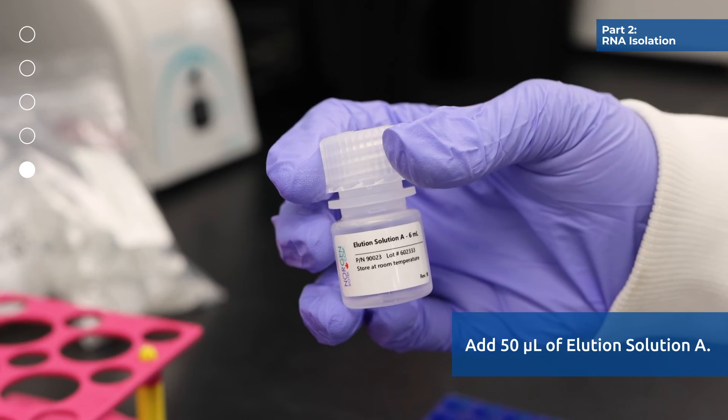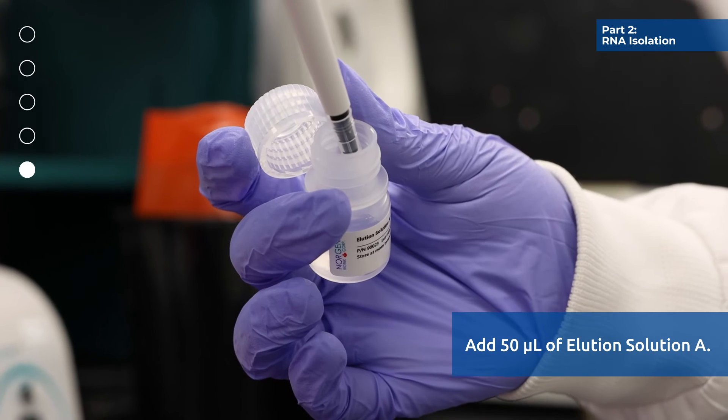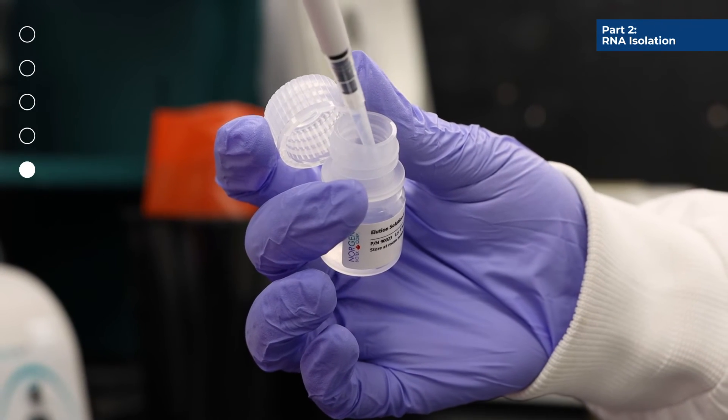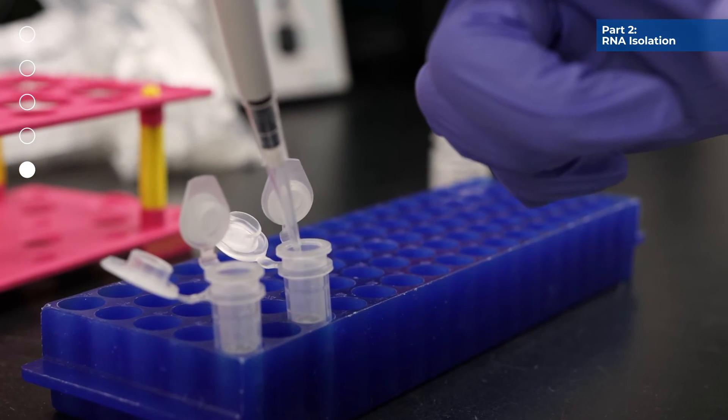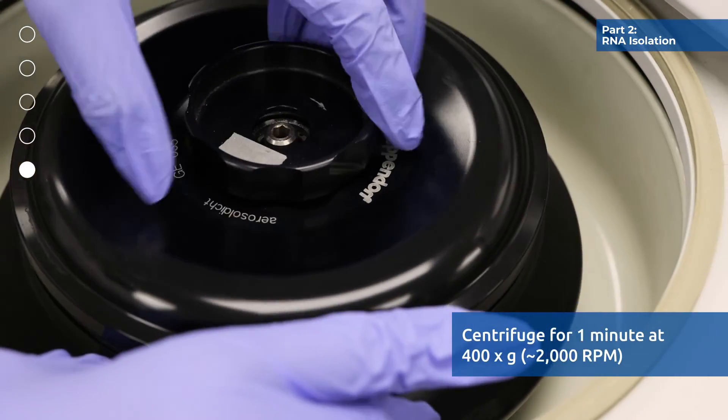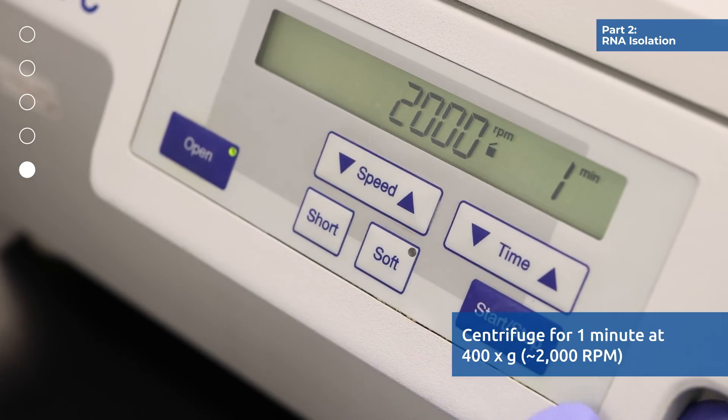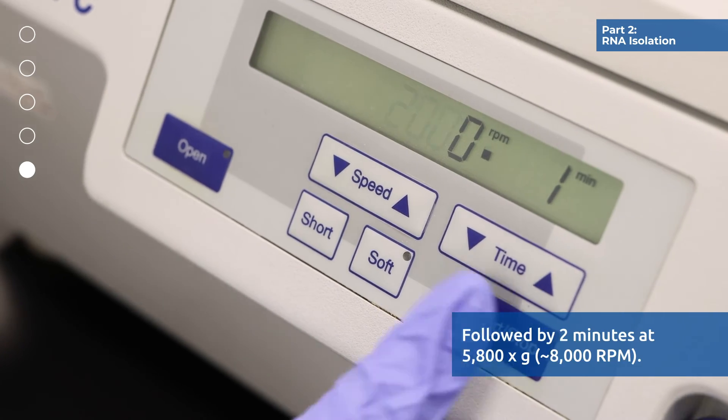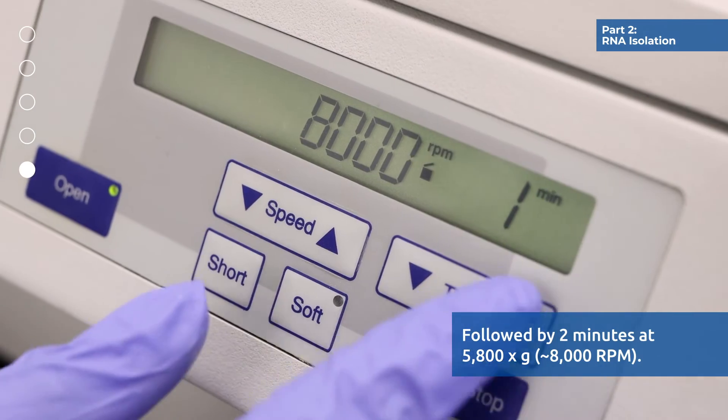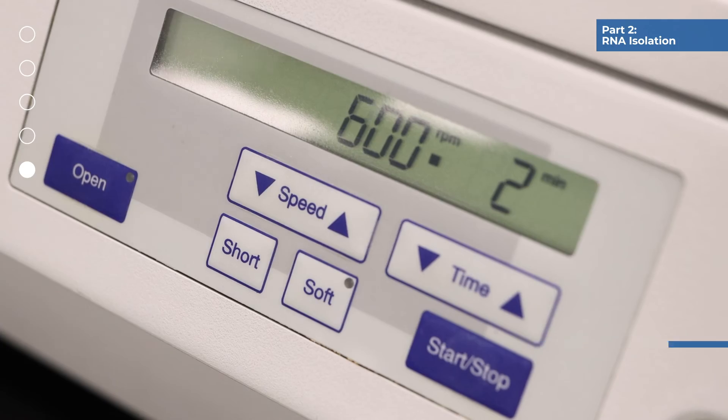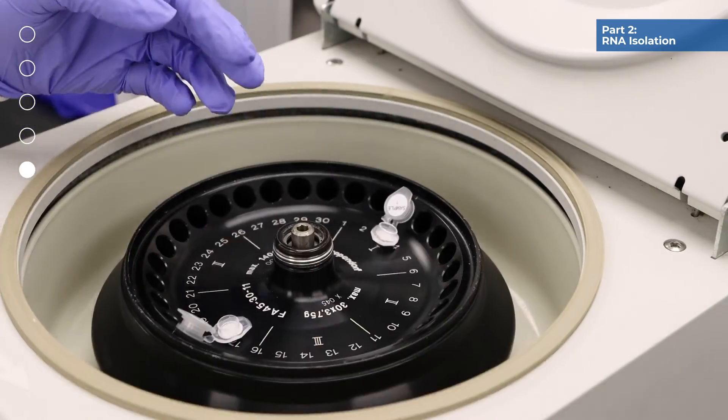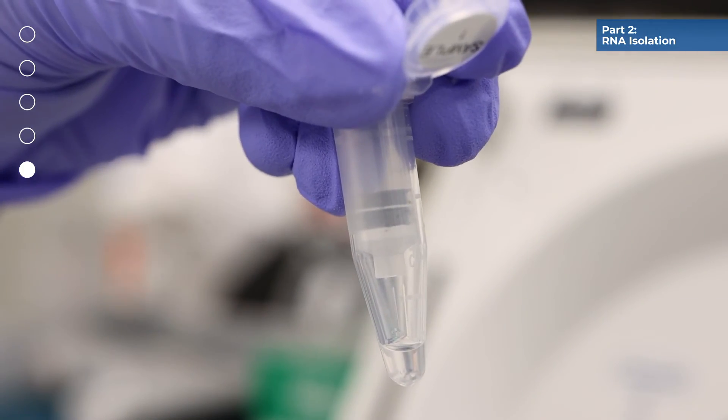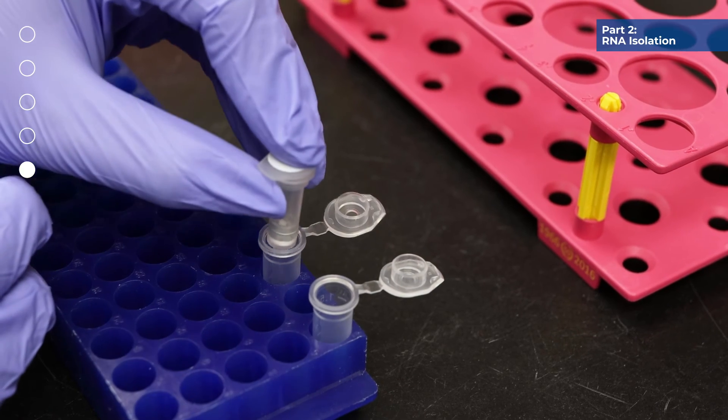Apply 50 microliters of elution solution A to the column and centrifuge for 1 minute at 2000 rpm, followed by 2 minutes at 8000 rpm. For maximum recovery, transfer the eluted buffer back to the column and let stand at room temperature for 2 minutes.